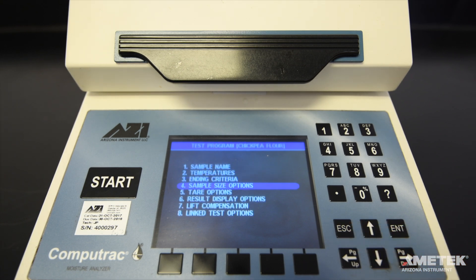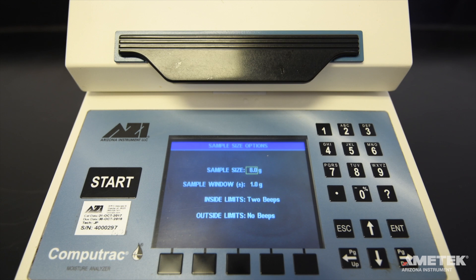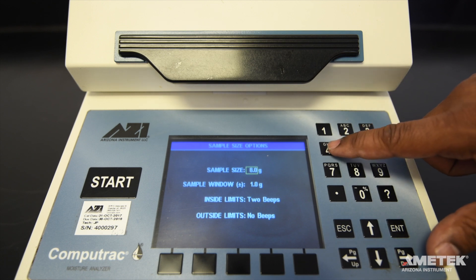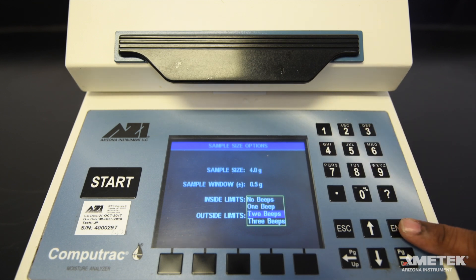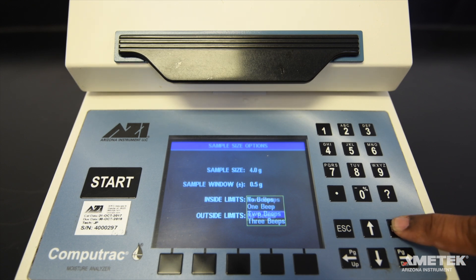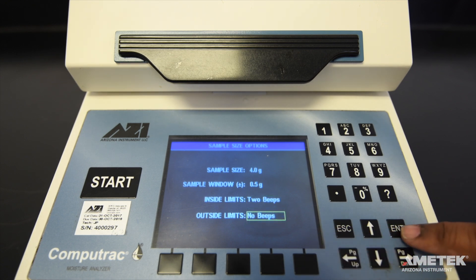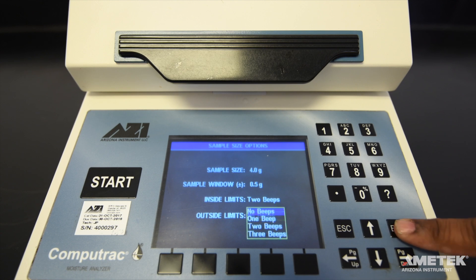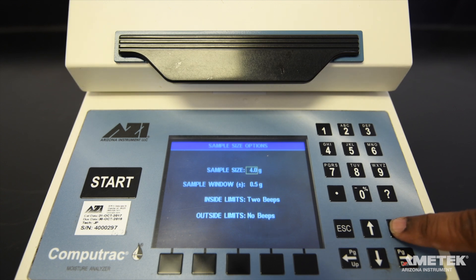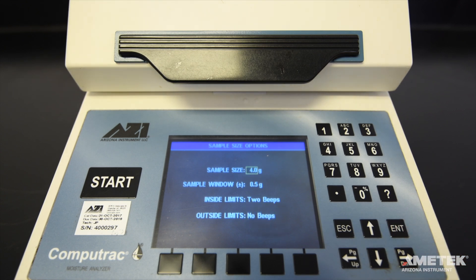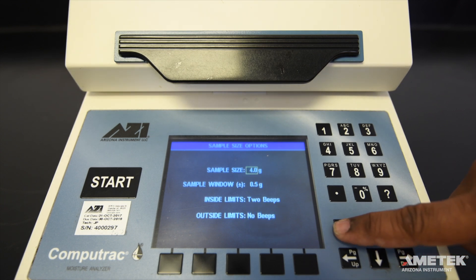Next up are the sample size options. Enter the sample size and sample window parameters. Select sound options for the inside and outside limits to allow the instrument to notify users when the correct amount of sample has been added to the pan. When you are done saving any changes, press escape to return to the previous screen.